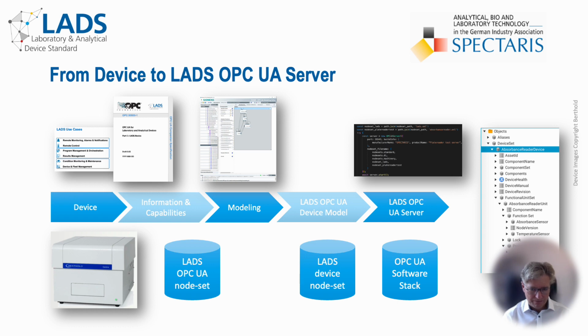Step 3. Model your specific device using the generic building blocks provided by LADS OPC. When done correctly, the result will be a LADS OPC compatible plug-and-play representation of your device's information and capabilities, exported as a node set file from the modeler.